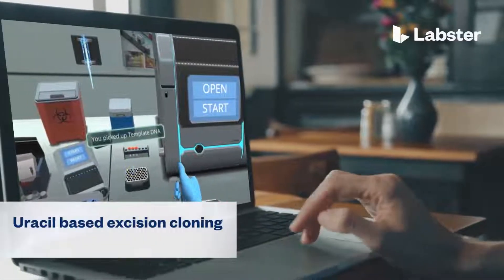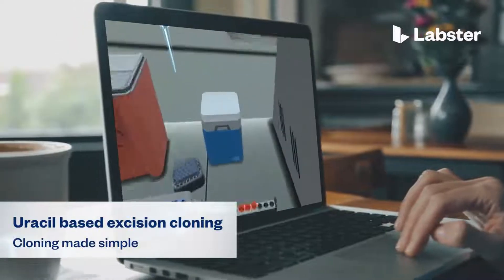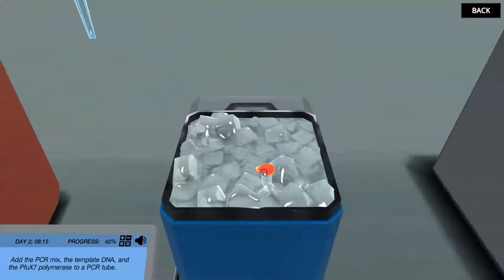In the Uracil-based excision cloning virtual lab, students step into a realistic lab experience where they can practice, learn, and explore science in an engaging and immersive way.